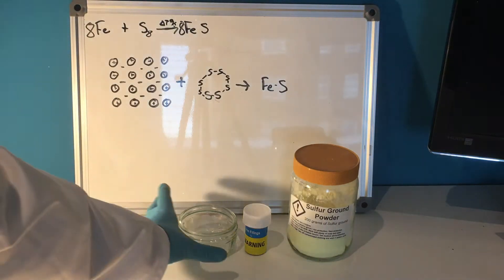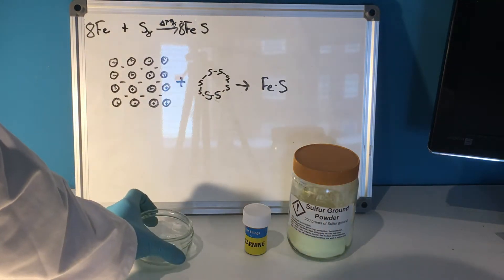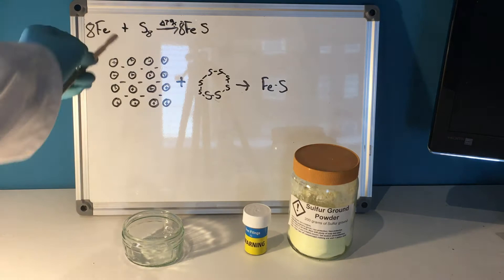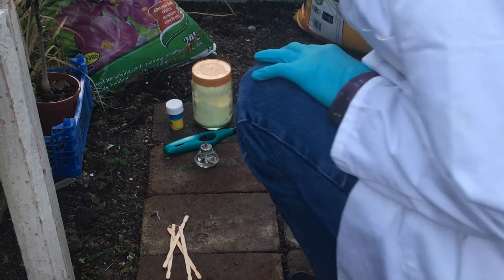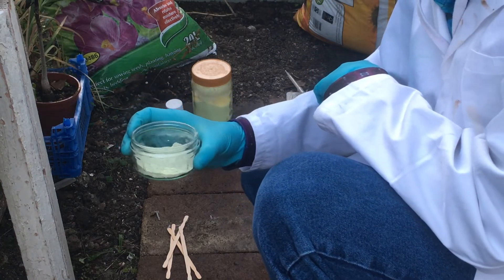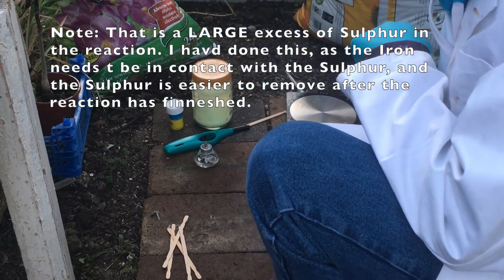It will be carried out in this small container, which is the closest thing I had to a watch glass. I'll be using some splints to try and light it, which will initiate the reaction as it needs quite a lot of energy to form the bonds between the iron and the sulfur. I've now mixed the sulfur and iron in a ratio of 7 to 4, mixing it to get a nice mixture. I'm just about to light it.